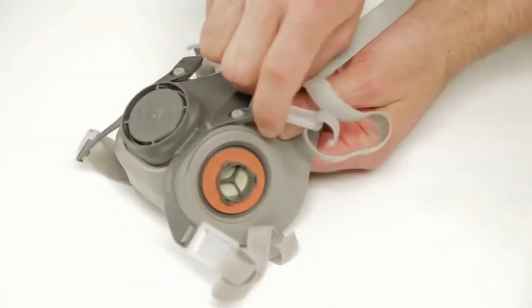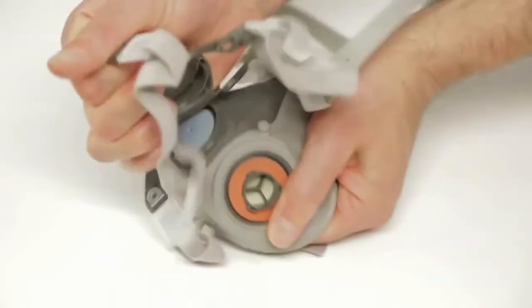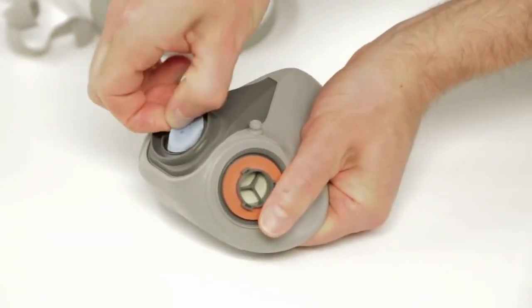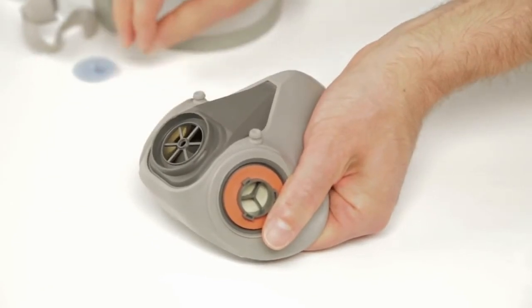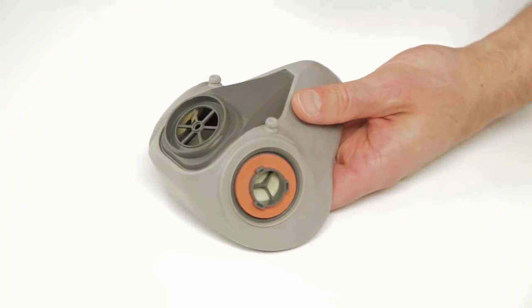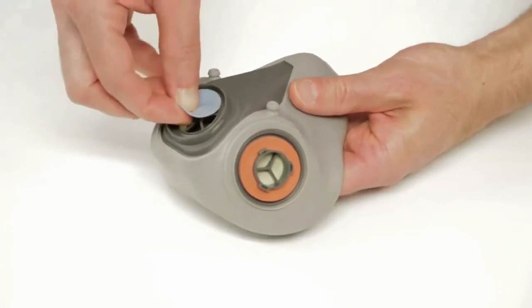To remove an existing exhalation valve, remove the respirator strap assembly as you did before. Grasp the valve and pull it off the center post. Inspect the valve seat to make certain it is clean and in good condition. To replace the exhalation valve, place the new valve over the exhalation port.